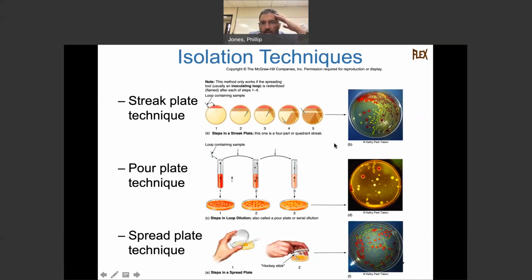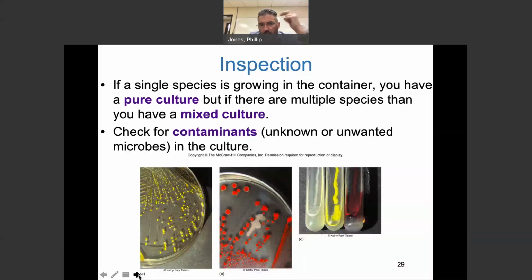All right. Here's pour plate. These are all forms of just serial dilution. Right. So we're just kind of diluting that population off in the hopes that we get one single bacterium to land somewhere, and then that single bacterium will grow into a colony. So this is the same inoculant, and this is how it grows. All right. So I still would prefer to do a streak plate. That would just be my form of doing it.